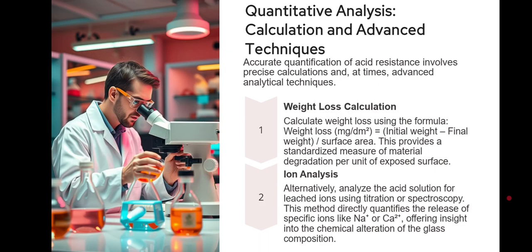Post-treatment cleaning and drying. After exposure, remove the glass pieces carefully, wash them thoroughly with distilled water, and remove the leftover acid. Dry them again at 105 degrees Celsius and cool them to reweigh them. Now compare the before and after weights, which tell us how much material was lost during the acid attack.